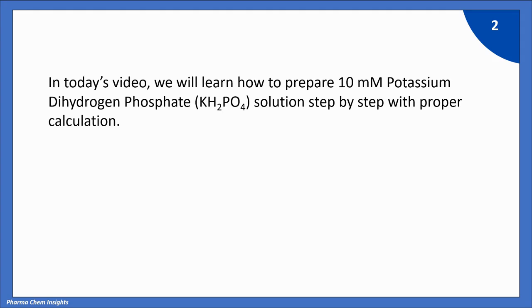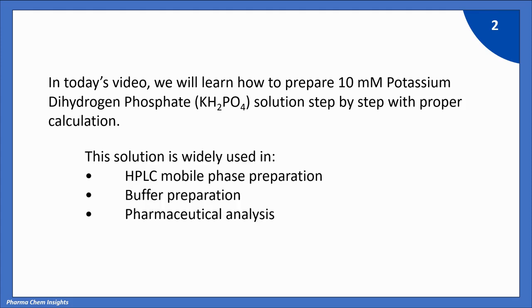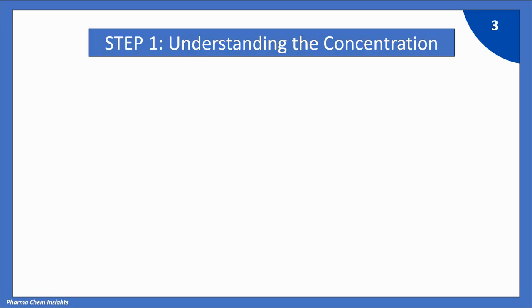In today's video, we will learn how to prepare 10 millimolar potassium dihydrogen phosphate KH2PO4 solution step by step with proper calculation. This solution is widely used in HPLC mobile phase preparation, buffer preparation, pharmaceutical analysis. So let's begin with the calculation.